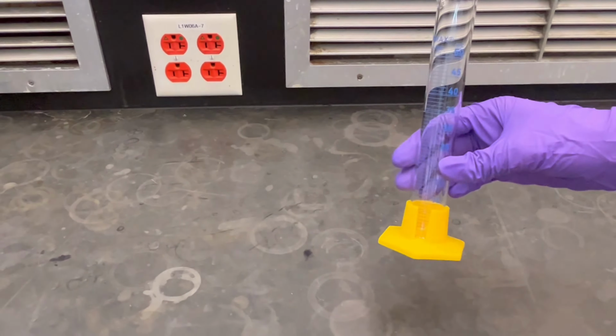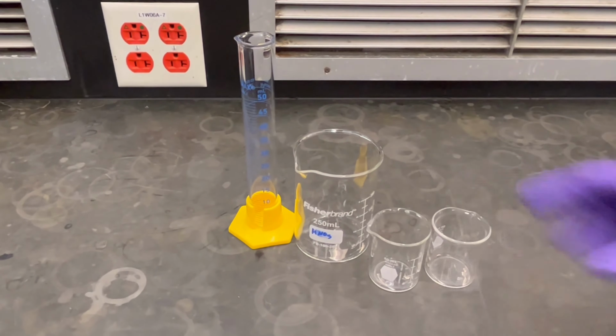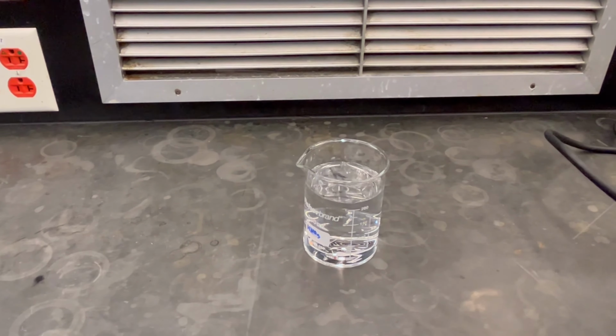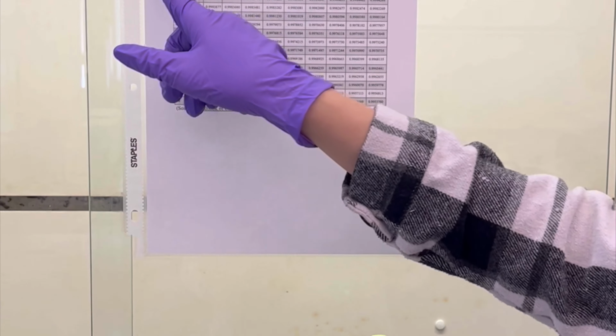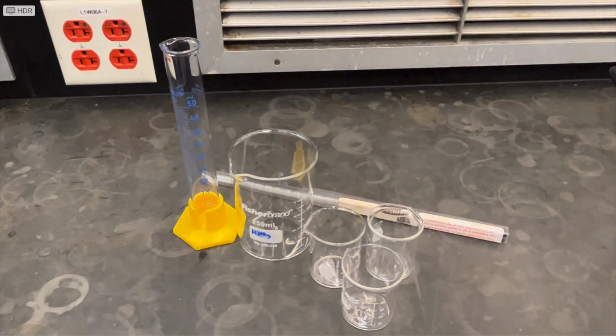Water. The equipment that we'll need for this part is a 50 milliliter graduated cylinder, a 250 milliliter beaker, 3 50 milliliter beakers, and a thermometer. Then getting our 250 milliliter beaker, we're gonna fill it to the 200 milliliter mark with DI water. Now we will insert the thermometer and wait 5 minutes. After the 5 minutes finish, read the temperature from the thermometer and go to your density table that you will find on the hood. Then record your density.